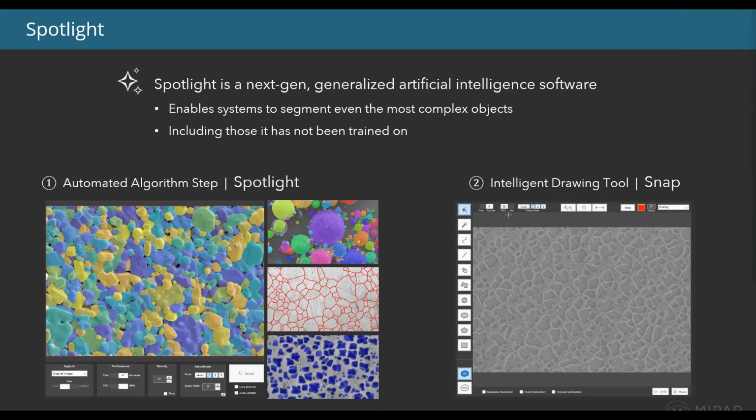In point mode, you simply hover over objects and it recognizes them, click to select. And in box mode, click and drag around your feature, release to select. As I mentioned, this is quite useful for dramatically speeding up and improving the precision of the feature tracings, which go into training your own AI models.